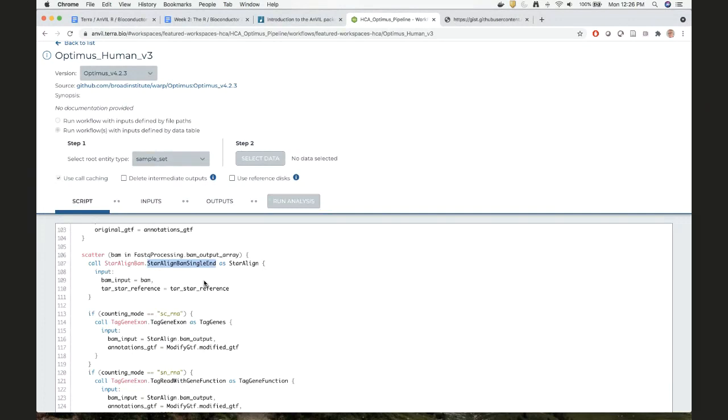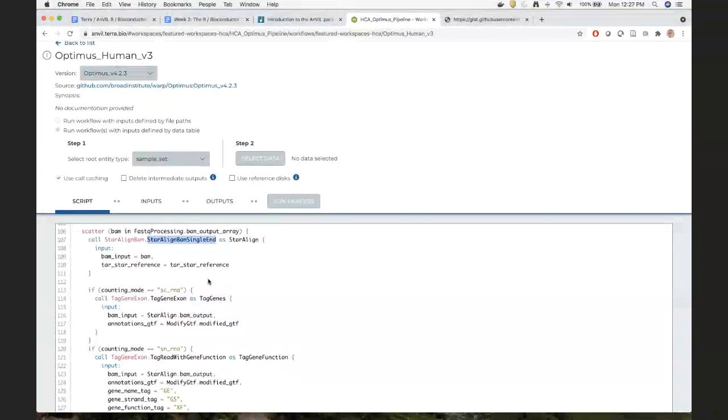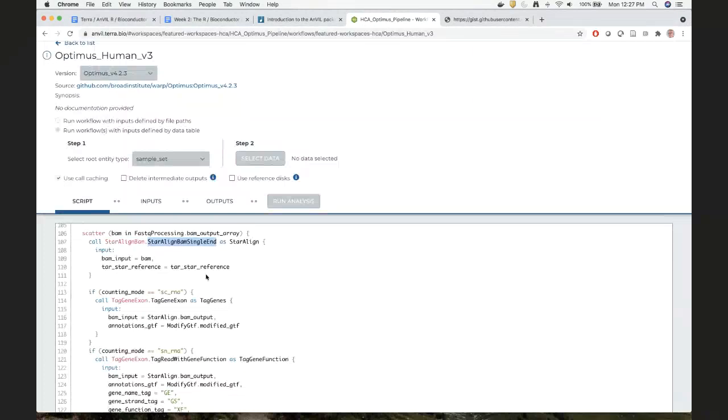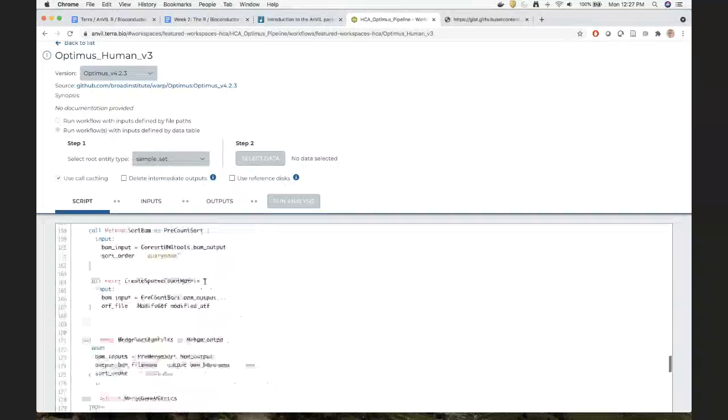So it'll allocate resources that way. Thanks. We'll see a simpler example next week, but those are great questions. And also, for you and I as end users, it's completely transparent. We don't know anything about the compute resources that are being required or anything like that. The person who wrote the workflow has figured that all out for us.